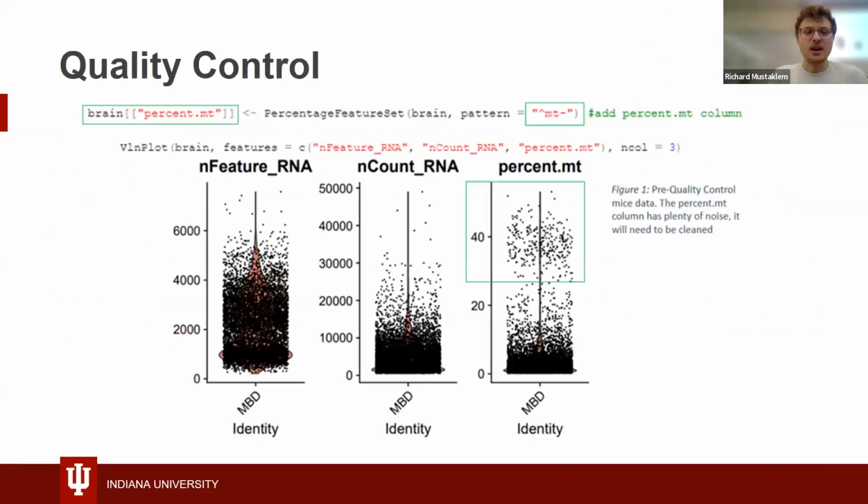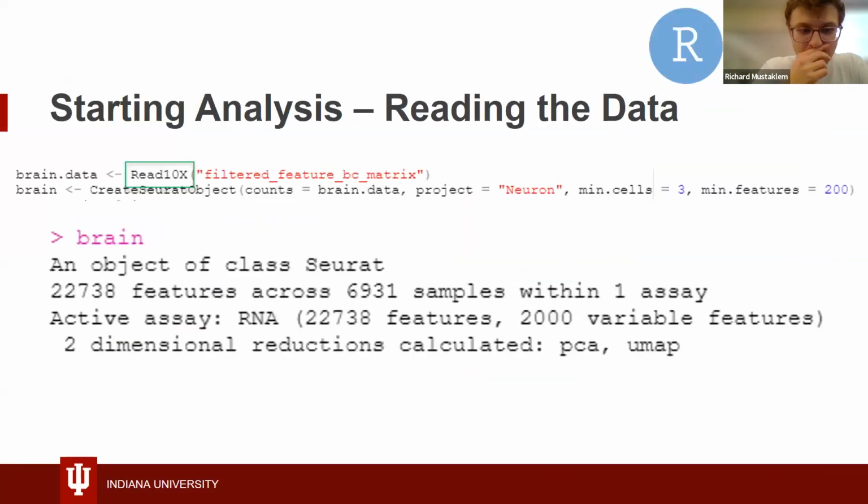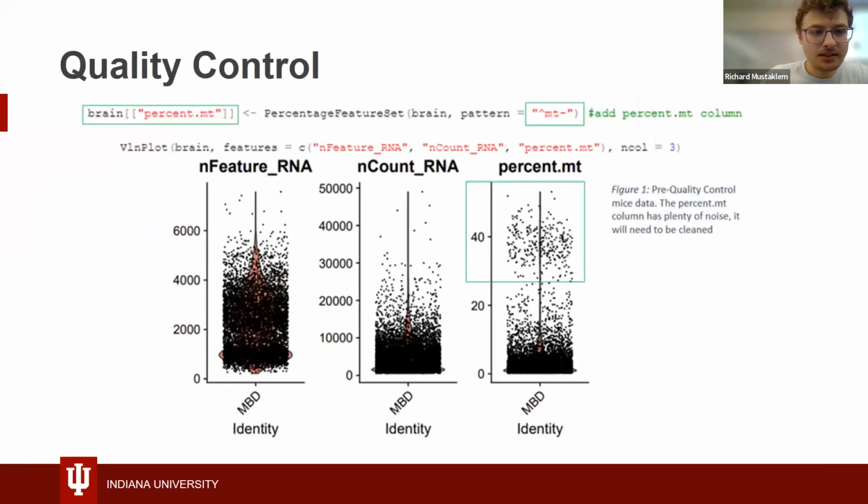That's good, thank you. Okay, so that was our first step: we're going to read in all of our data. Our next step is going to be looking into quality control. Emmanuel, this might help you a little bit, but we talked earlier about doublets. This is a big problem within single cell: sometimes your cells will just explode because they're very fragile. You can look at this column that we're going to artificially make, the percent mitochondria column.